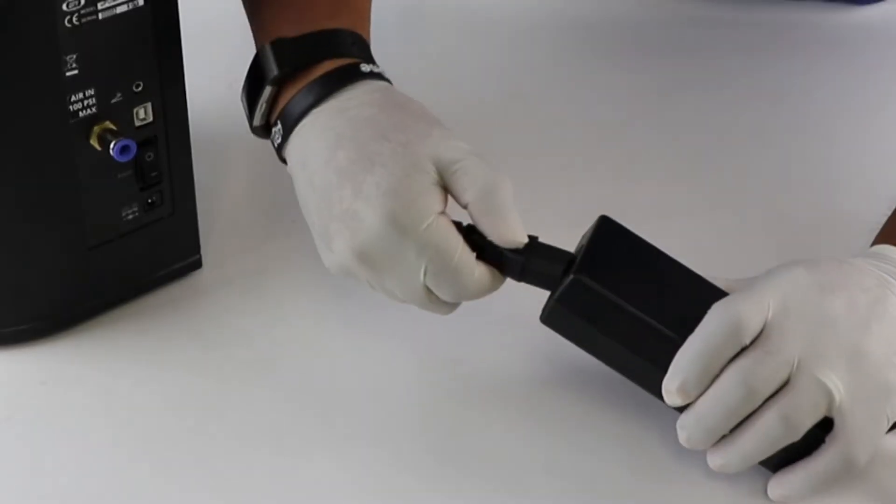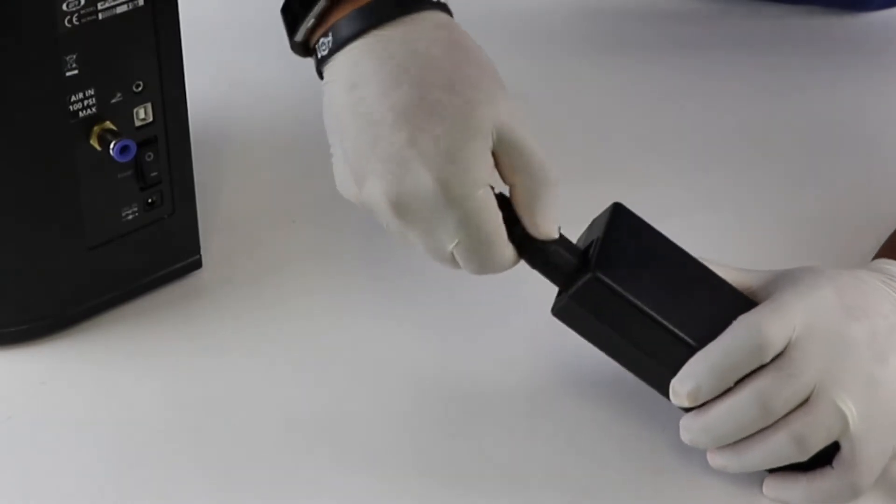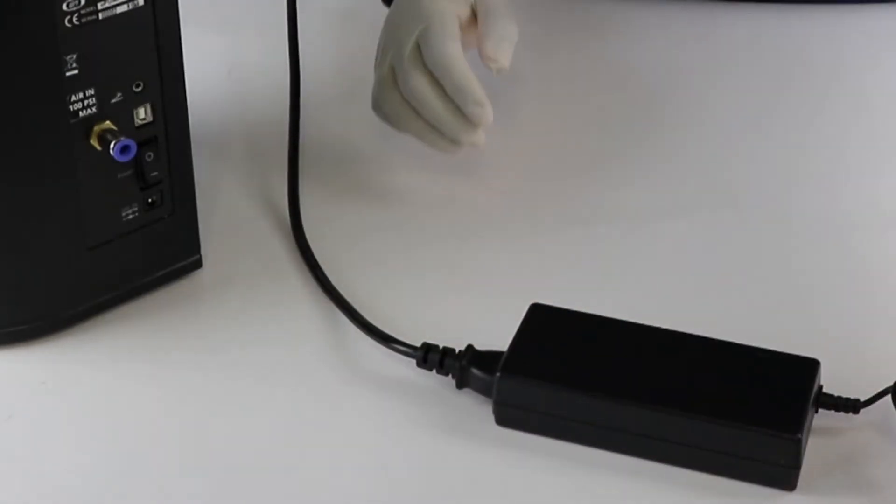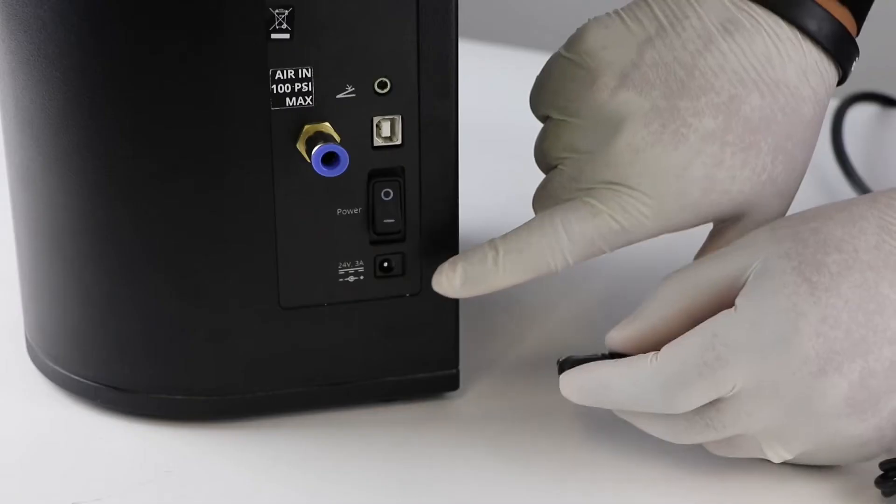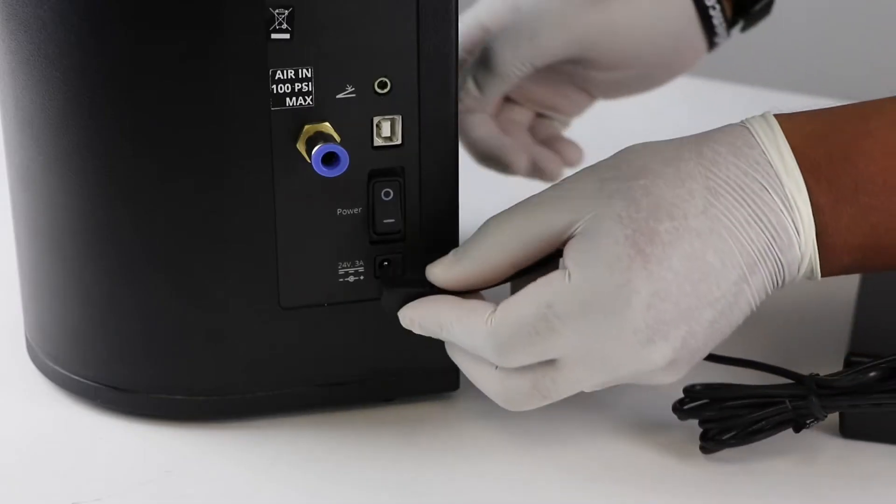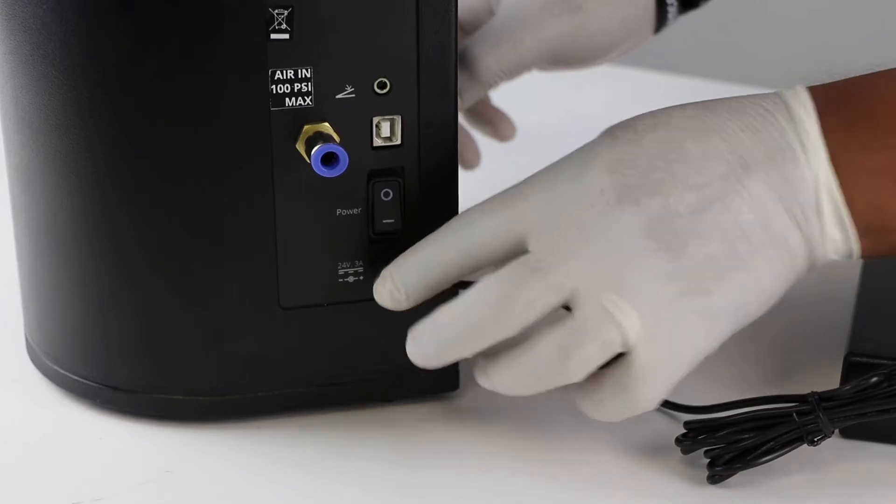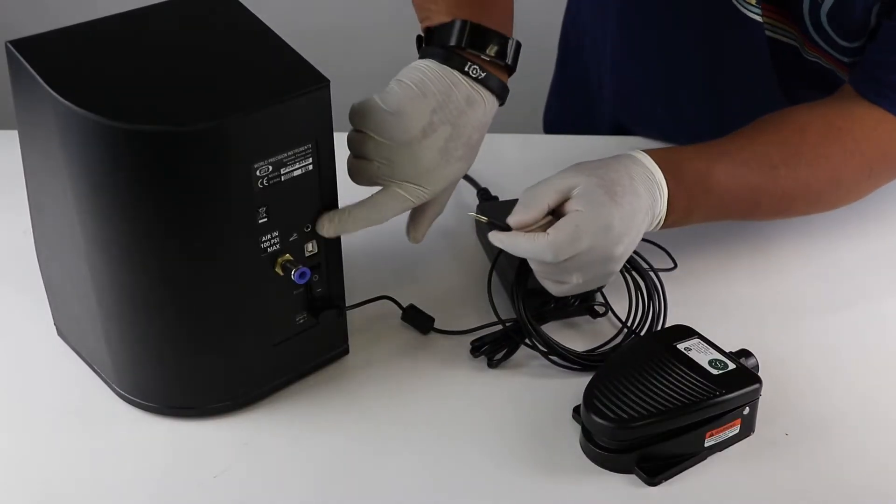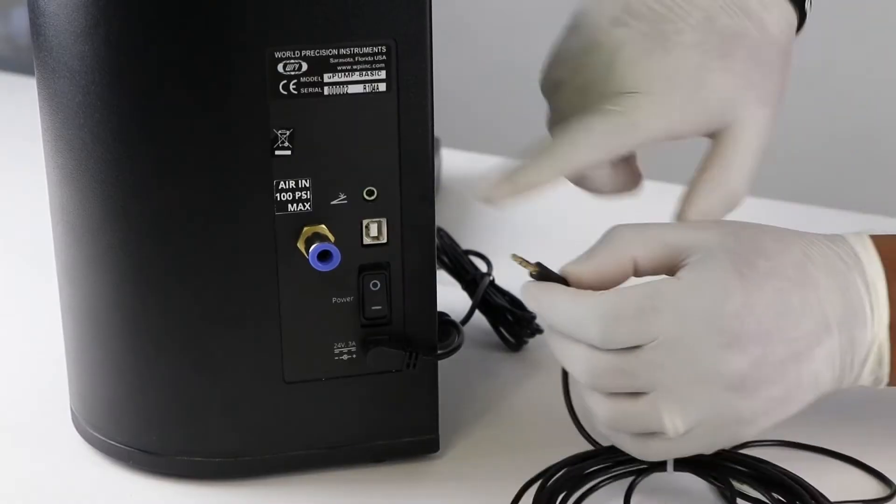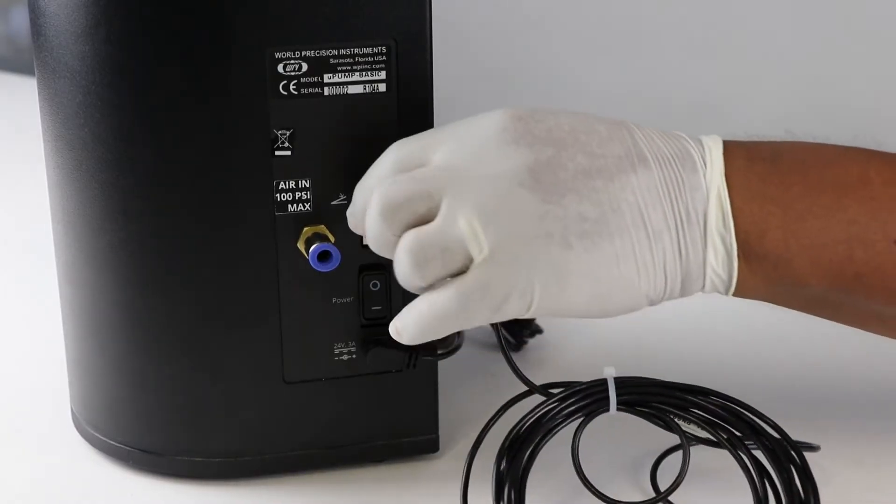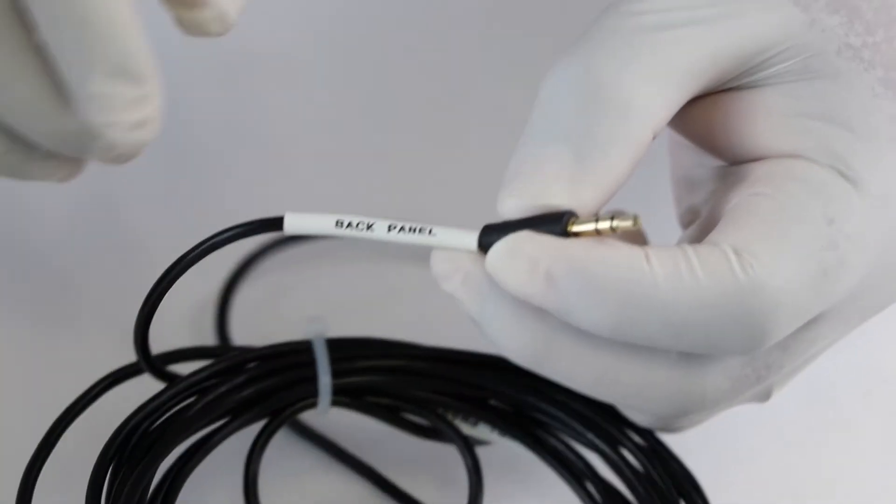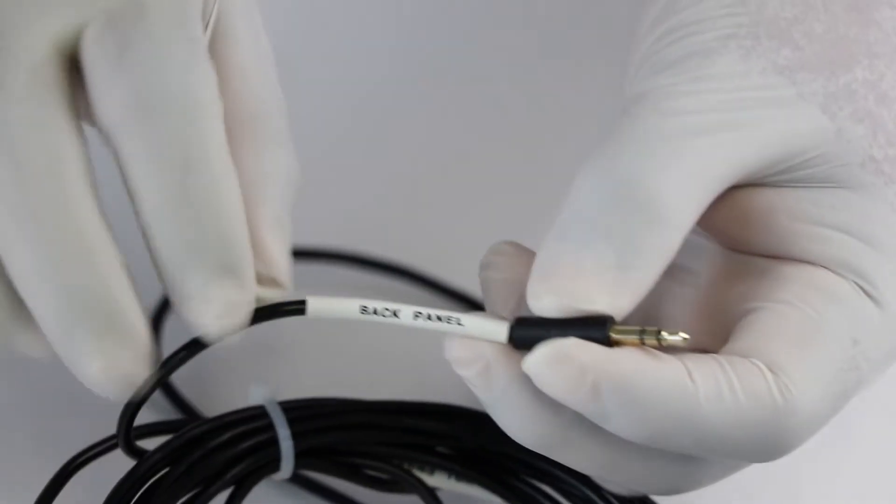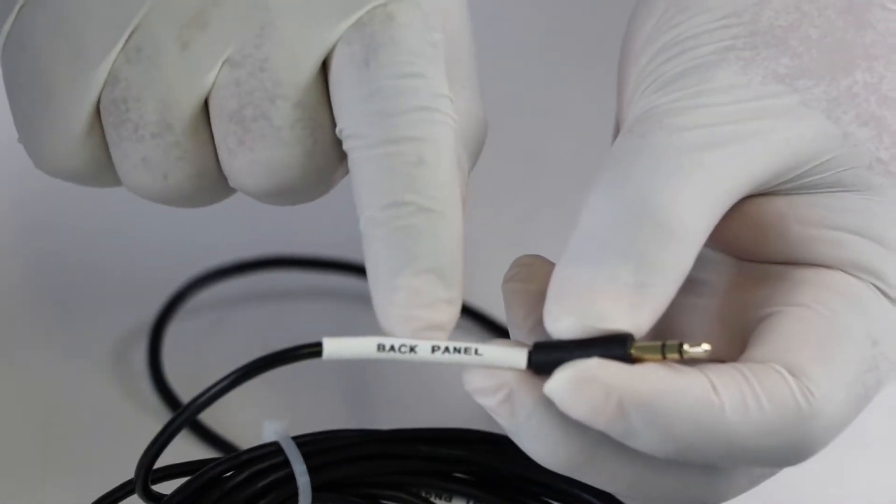The first thing we need to do to set up the system is connect the power supply to the rear of the unit and plug it into a wall outlet. Plug the foot switch connector into the foot switch port. The foot switch connector is labeled back panel.